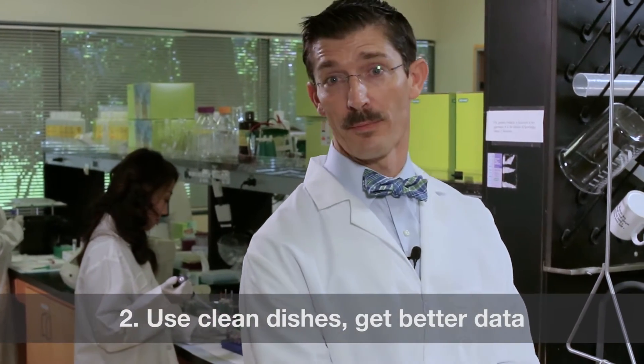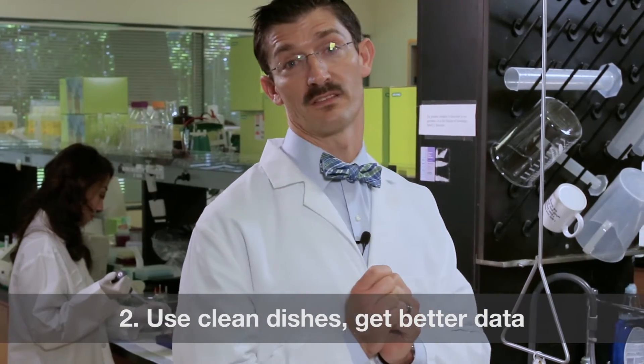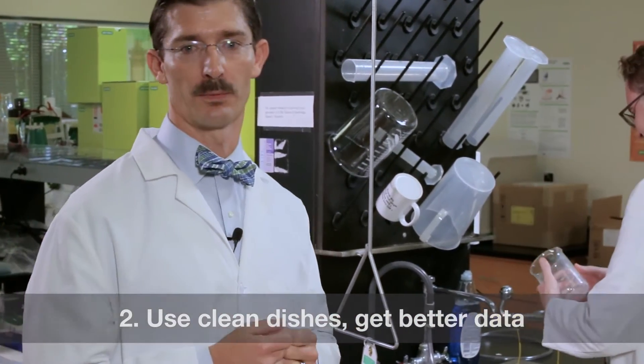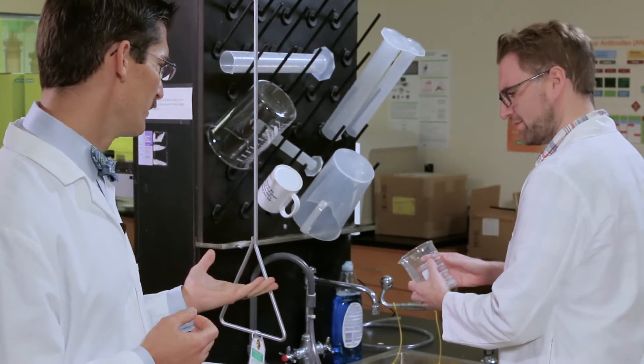Fluorescent Western blotting can lead to high background levels. So remember, use low fluorescence PVDF membranes, and always make sure to use clean lab supplies to avoid autofluorescence. That's just gross.